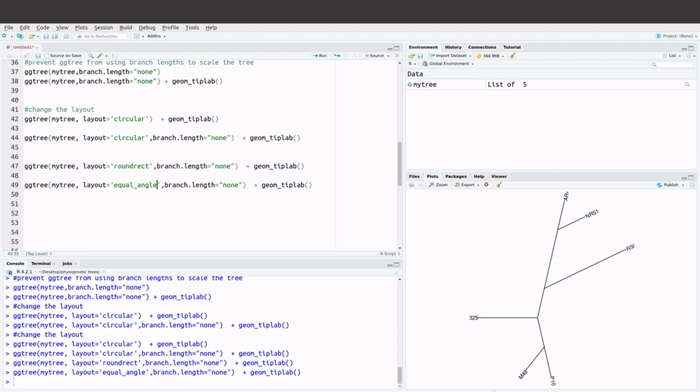And so this means that we are going to use the second tree, the one that I made mention of, which is here. Let's look at that. This one here. This tree has bootstrap values. So we are going to read this tree and then visualize it. And then we will look at the bootstrap values that are displayed. So let's go back to the R interface.